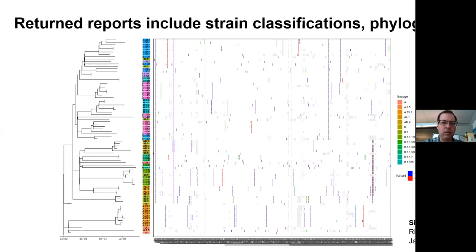This is just a snapshot of a random plate of positive samples that we've sequenced for variant of concern screening. But if this was a plate from an outbreak, you could very quickly discover which samples were highly related to others simply by looking at the tree, and then maybe deduce that there's some kind of transmission going on in a hospital or a clinic, or whether it's just chance encounters of multiple people arriving at the hospital in a short amount of time, but with completely different strains.